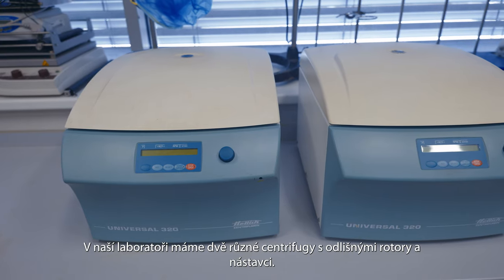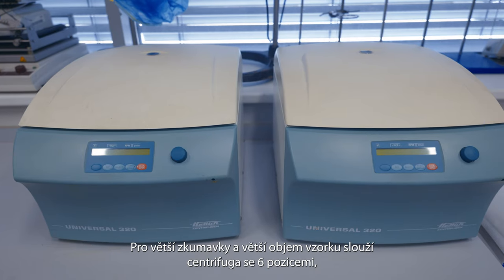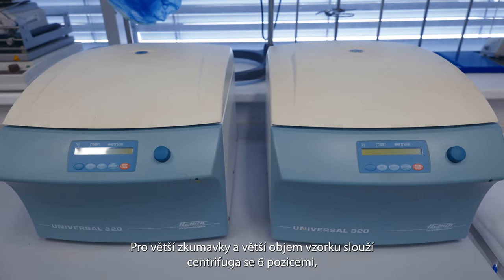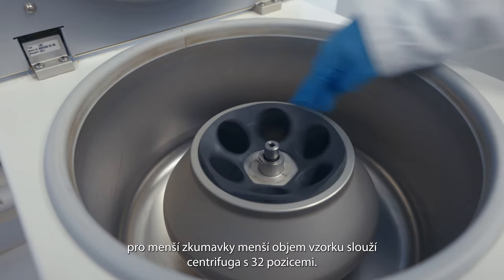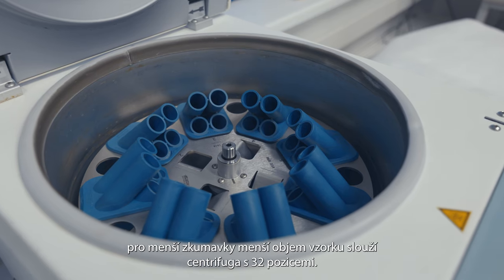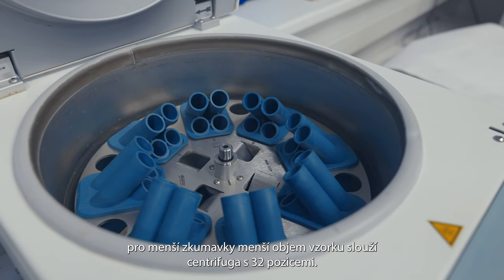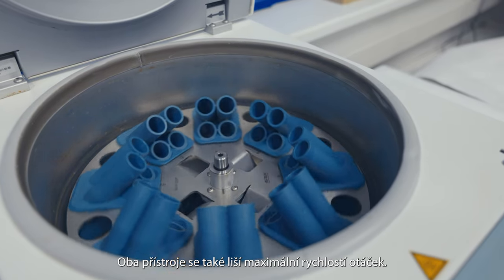In our laboratory we have two different centrifuges with different rotors and holders. For larger tubes and larger sample volumes, we use a centrifuge with 6 positions. For smaller tubes and smaller sample volumes, we use a centrifuge with 32 positions. The two instruments also differ in their maximum rotational speed.